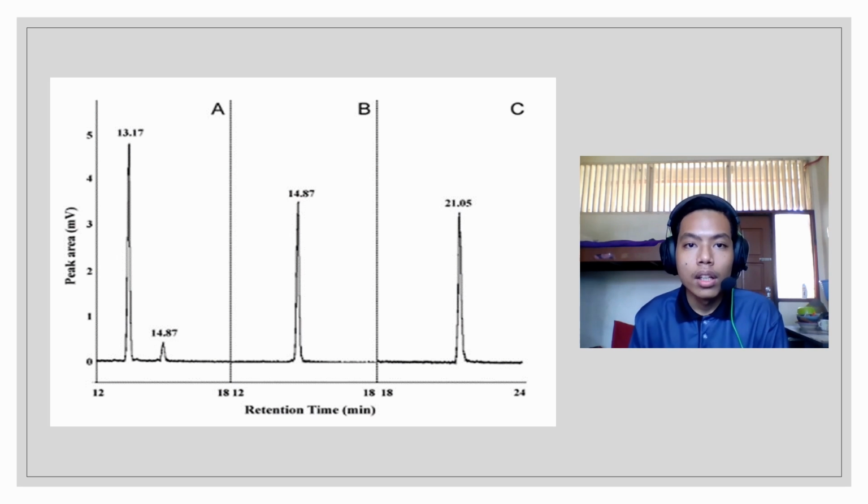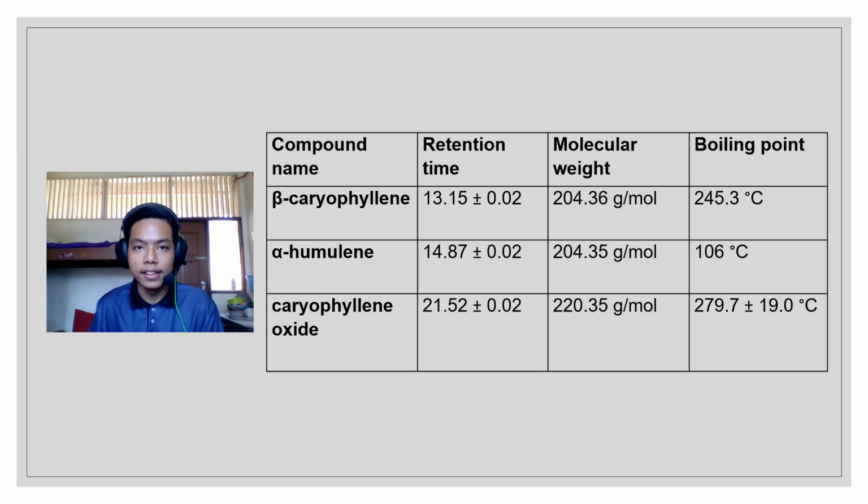As the results, a validation method was carried out utilizing beta-caryophyllene, alpha-humulene, and caryophyllene oxide as reference substances to quantify the compounds. These terpenes were chosen since they were found in every Copaiba oil sample previously examined. For these chemicals, the approach yielded good resolution, indicating high specificity and selectivity. This approach was particular to the standards and did not interfere with the retention time peaks. Mass fragmentation in gas chromatography mass spectrometry confirmed the purity of the peaks.